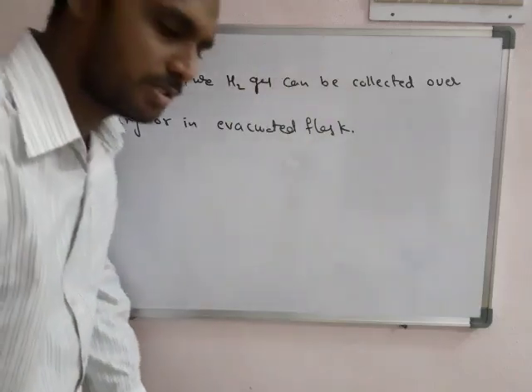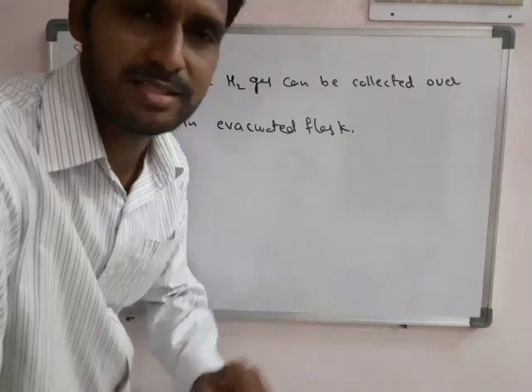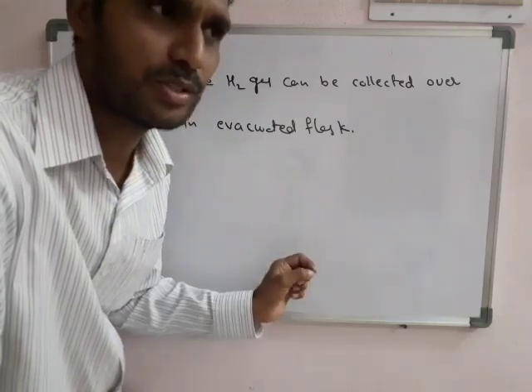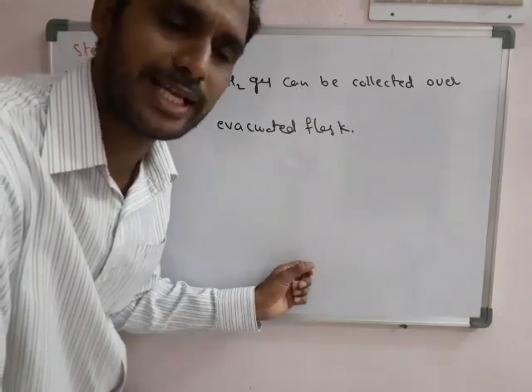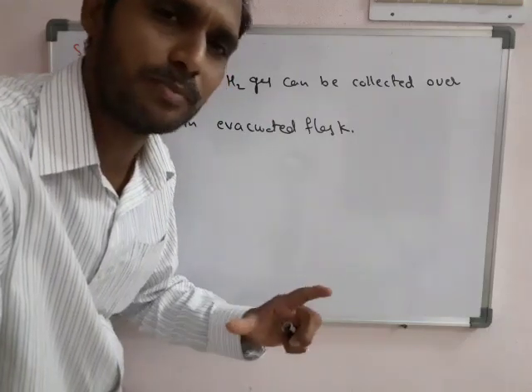Okay, so after that it is stored in a perfectly sealed cylinder. So this is the preparation of hydrogen gas from granulated zinc, and at last we got the pure hydrogen.